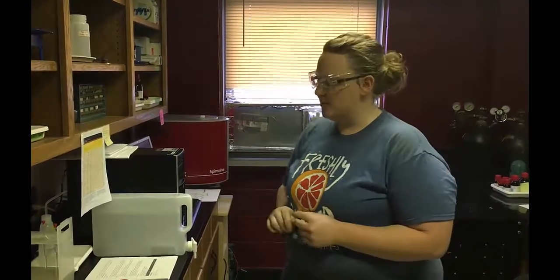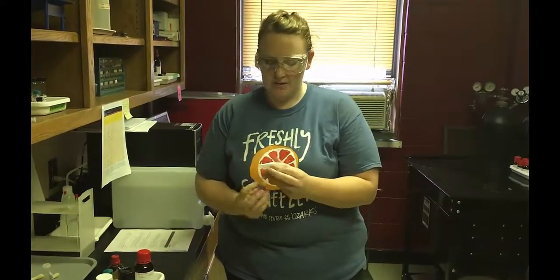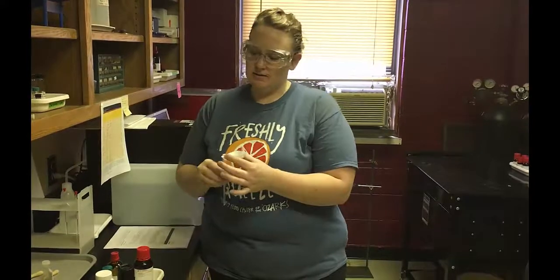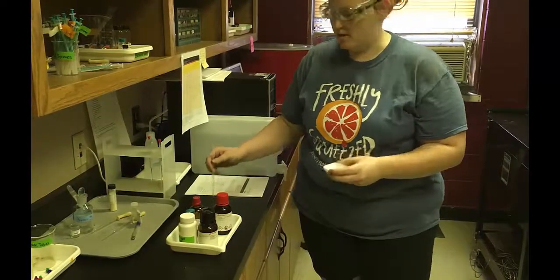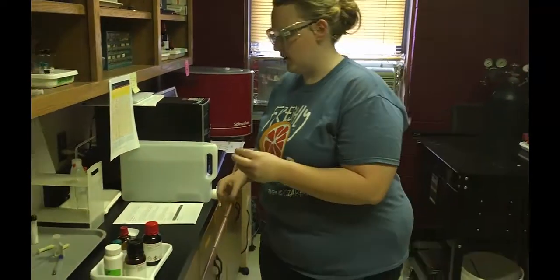Today I'm going to show you how to make an NMR sample. So here I have an NMR tube and a little bit of vanillin. You're going to take the open end of the NMR tube and go straight down onto your product, and then tip it back and just tap it on the table to try to get all your product down into the bottom of the NMR tube. You're going to need about 1/8 of an inch of product in your tube.